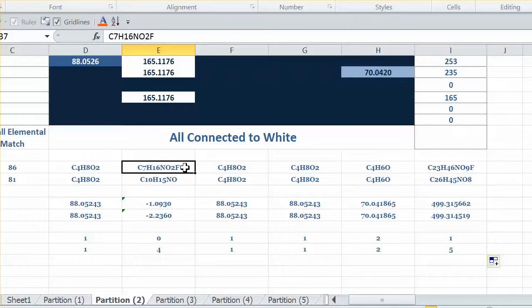So now a nitrogen can connect to 2 subfragments because you could have an NH2 and each of those H's could be displaced by another subfragment. So we can't rule out either one of these formulas based on the rings and double bond equivalents.